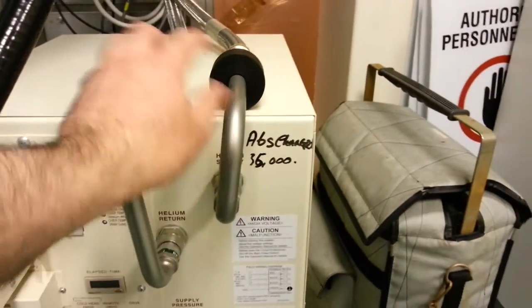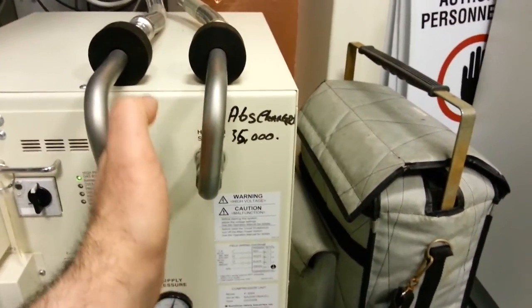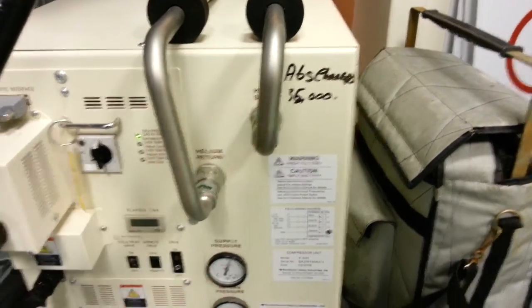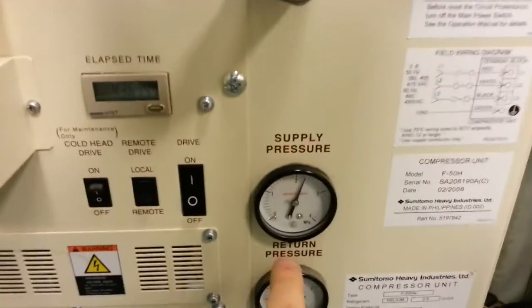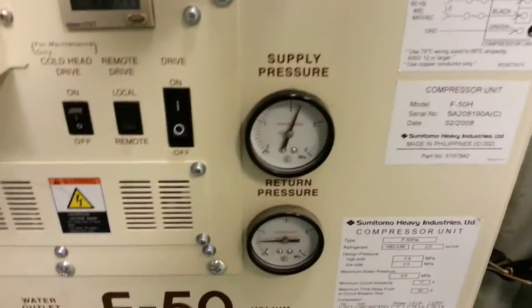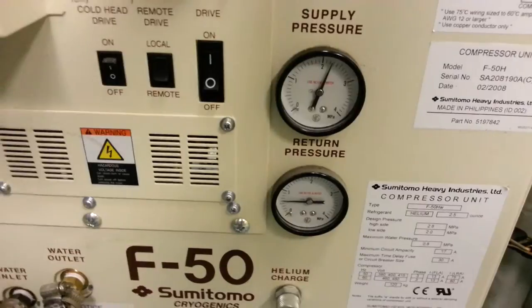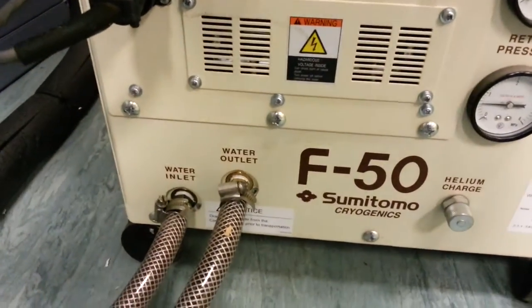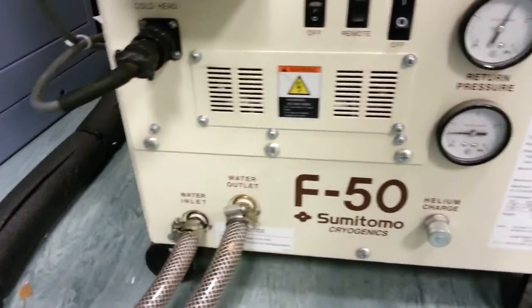We've got our helium lines here — return here and flow here. I put my hand on it and it's actually freezing because it's just been through the heat exchanger. We can see the supplied helium pressure: 2.2 MPa, about 300 odd psi. And return about 500-600 kilopascal, so about 70-80 psi. We've got water inlet and outlet from the main chiller unit we saw behind us.